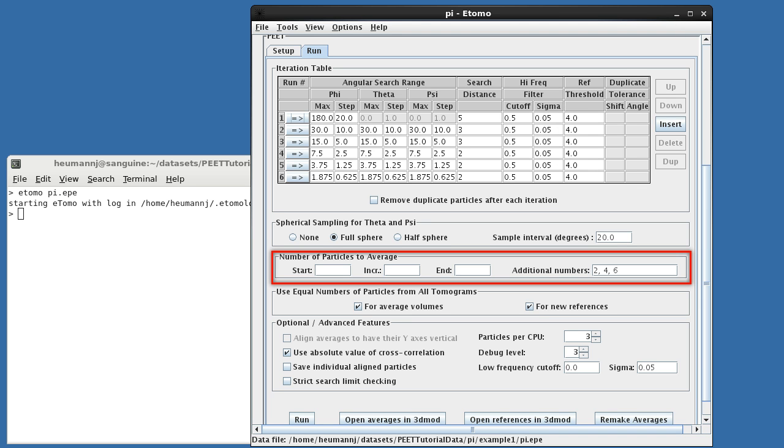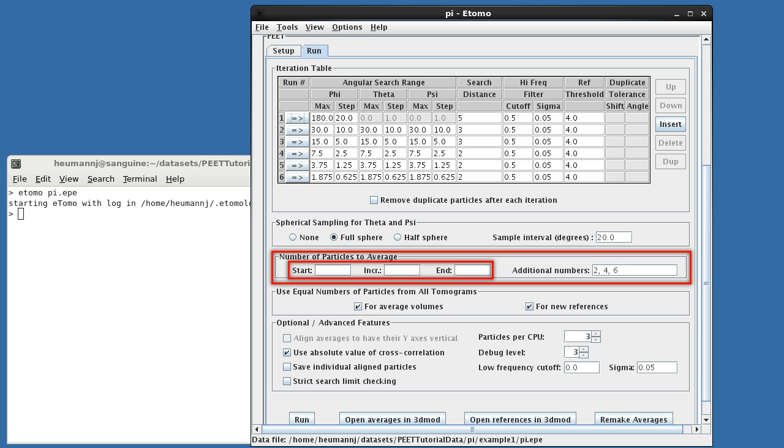Next, we need to specify the number of particles to be averaged when alignment is complete. Here, we've chosen to create averages with two, four, and six particles. We could have achieved the same result by specifying two, two, and six as start, increment, and end, respectively. Start, increment, and end can also be used simultaneously with additional numbers, as long as the latter are monotonically increasing and greater than end.